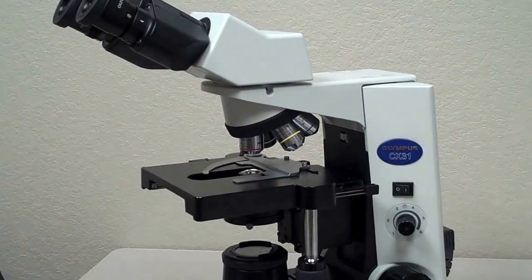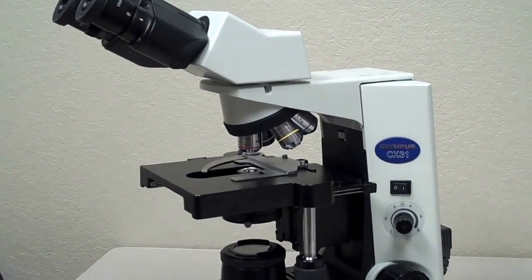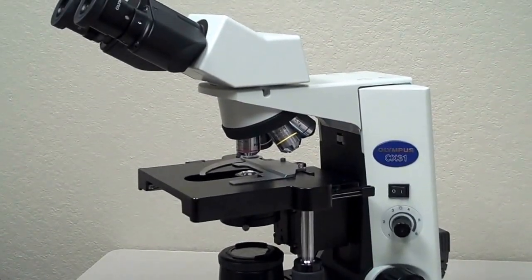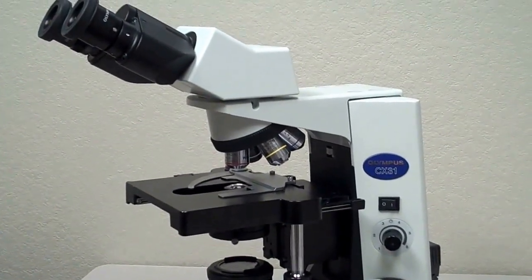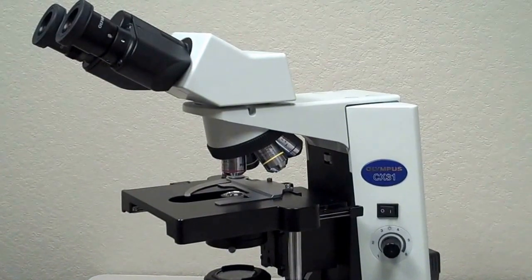Today I'm going to go through the parts of the Olympus CX-31 microscope that we use in microbiology at Mesa Community College. In this video I'm going to go through the different parts of the microscope and the functions of each one of those parts.